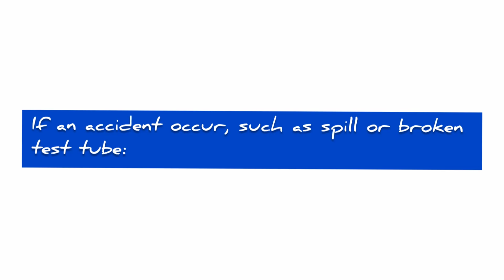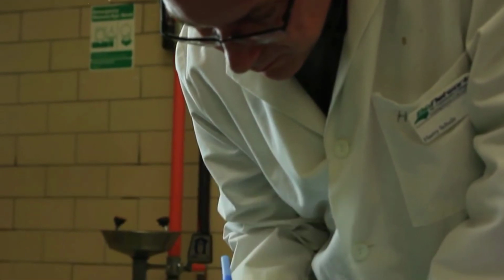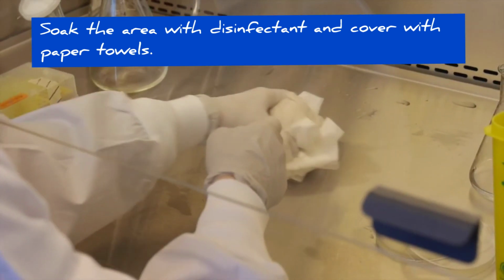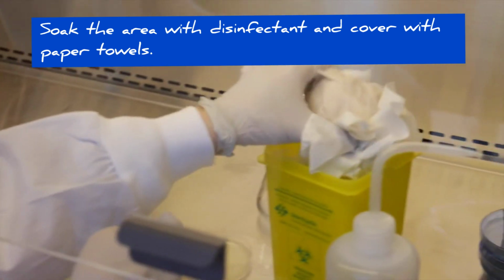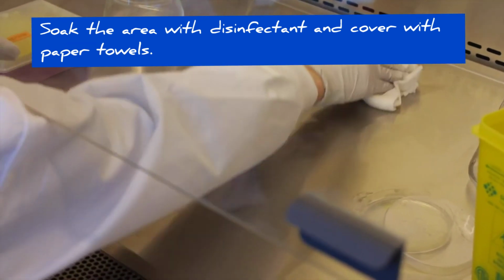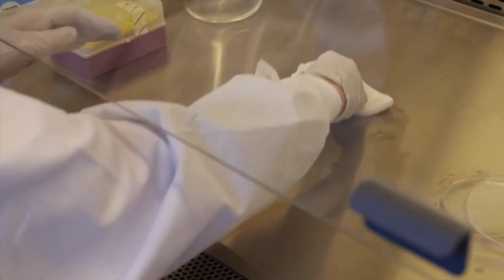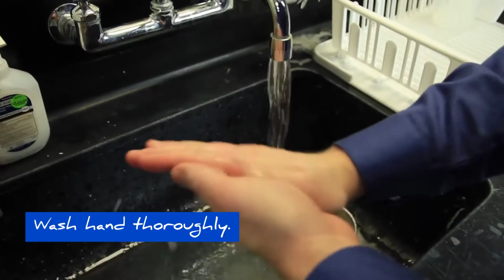Rule number 11. If an accident should occur, such as a spill or broken test tubes, inform your instructor immediately. Soak the area with disinfectant and cover with a paper towel. Dispose of the contaminated paper towel in the biohazard bin. Dispose of contaminated broken glass in the sharps container. Wash hands thoroughly.